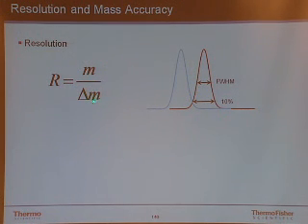That's 10 to the minus 5, and that's 10 to the third, then in fact you're talking about a resolution of better than 1 part per million. Okay? Now, so that's the definition, and that's the way we measure that.